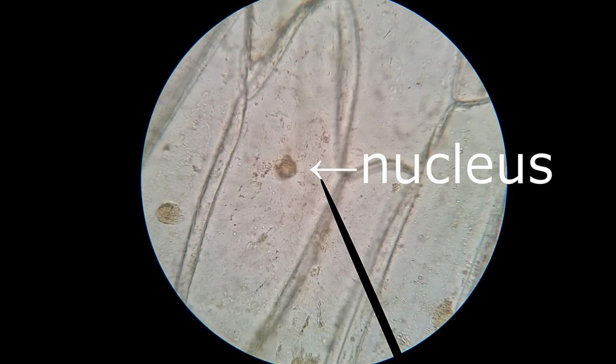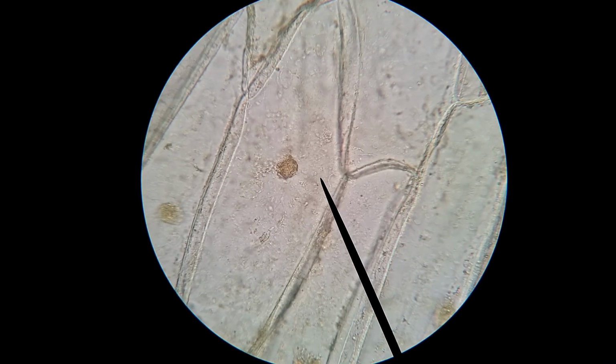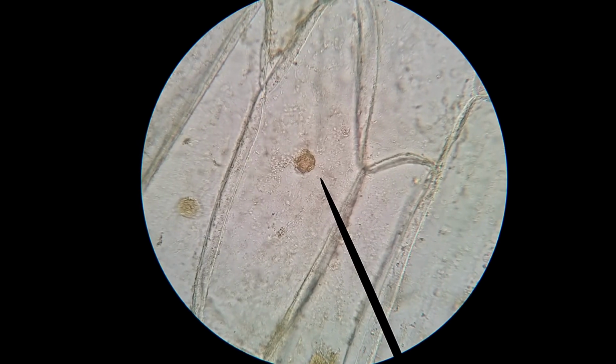In addition, you can see a structure in these cells that we talked about yesterday. What we're looking at right now is the nucleus of the cell. It contains the instructions for the cell to perform all of its functions. It also controls when this cell will multiply to make more cells.